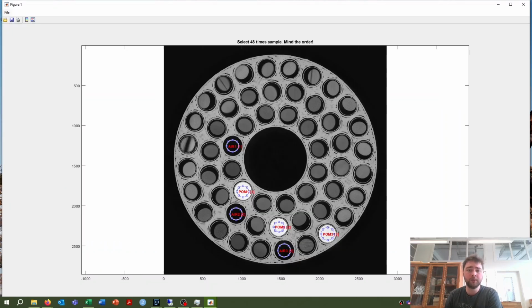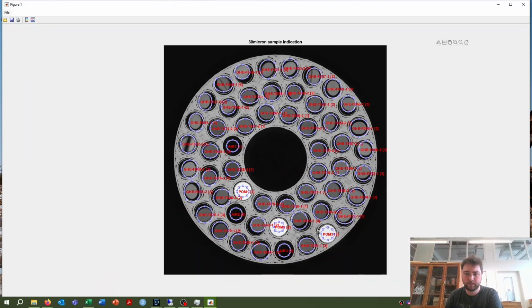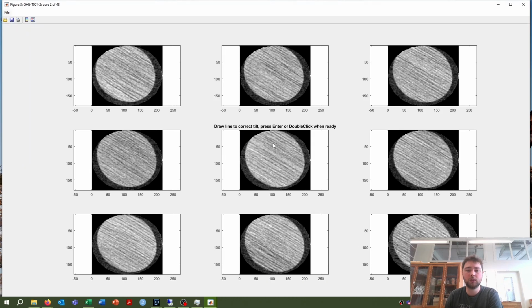I'll again use a linear trend, and then again use ellipses. And I will indicate all of them like we did last time. Okay, I have now indicated all of them. And again, we now indicate the direction of the fibers. The last ones were softwood. This is hardwood, mostly tilia. So here the fiber direction is a little bit easier to see.